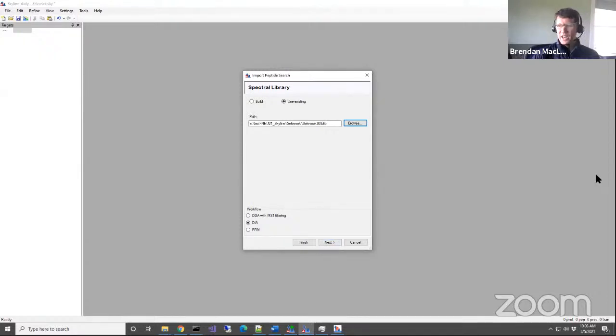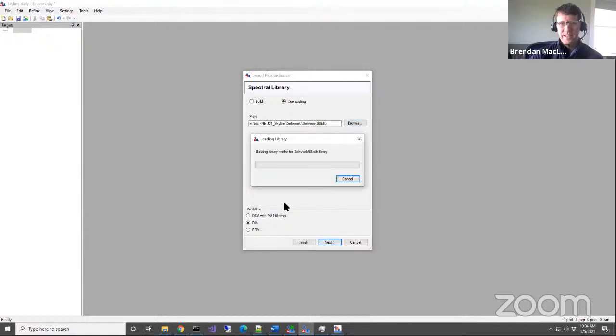But I can also make those files available. They're actually not up on the FTP site. I had to ask Ludovic and Natalie for them, but they sent me all those files, and I can make those available for anybody who wants to go through this build from scratch. Go ahead and chat me that you want those files. So let's go ahead and do next.